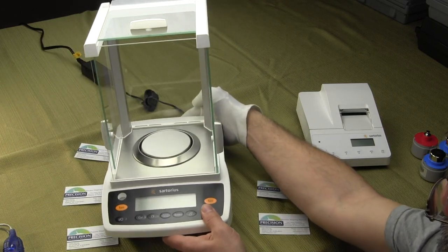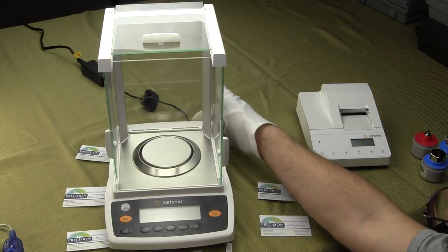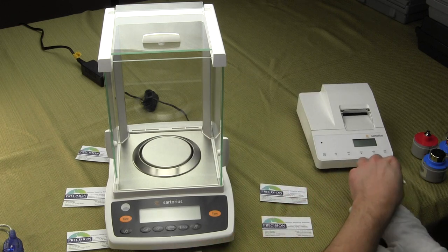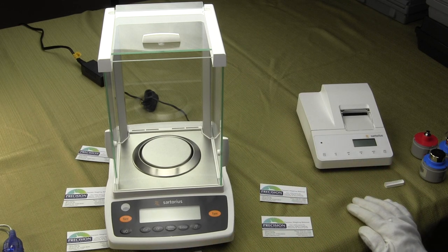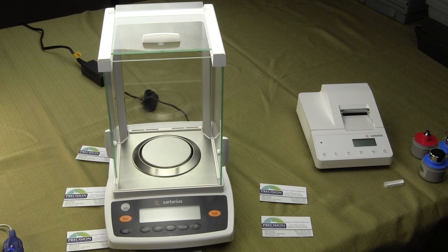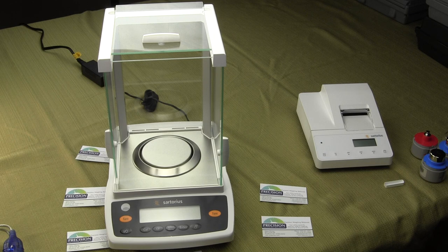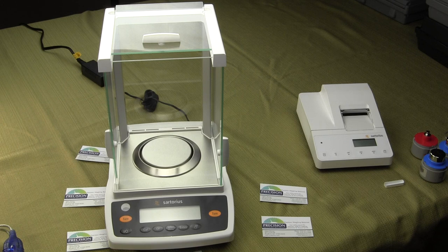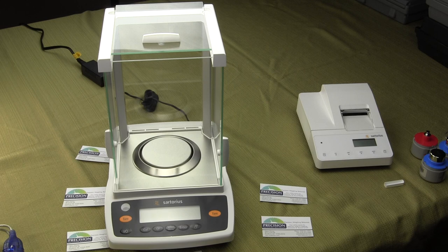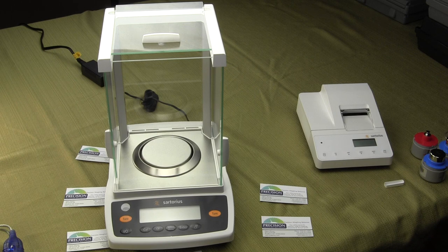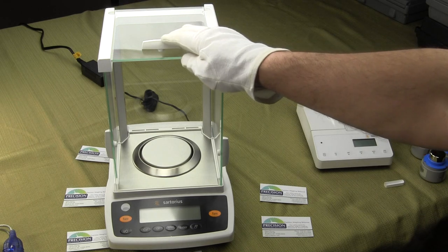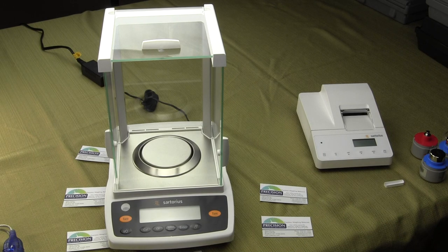This is Sartorius' new economy version. The balance is presently assembled and made in Germany. It's a high-quality balance and very affordable for the laboratory. We highly recommend it for those people looking for value and performance. Sartorius holds the Guinness Book of World Records for the most accurate balance in the world, and they've been building balances for 145 years.